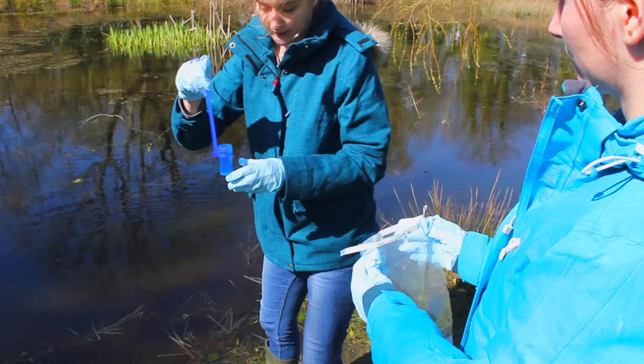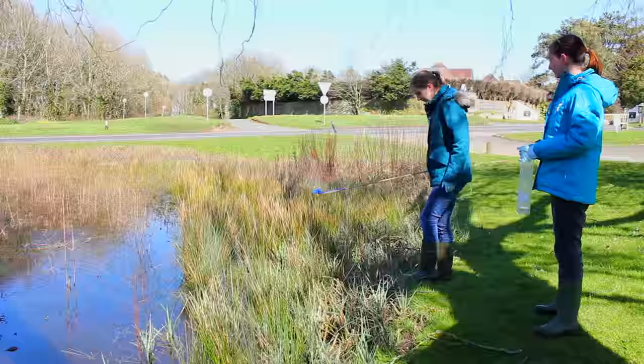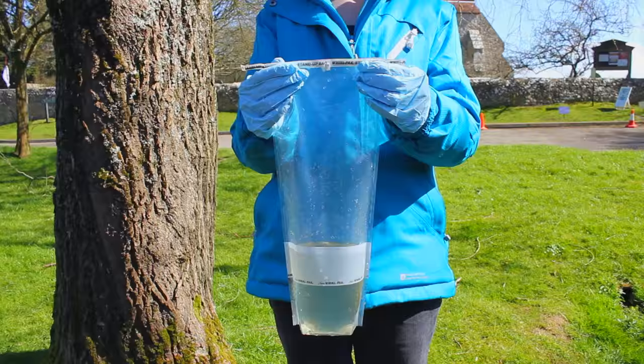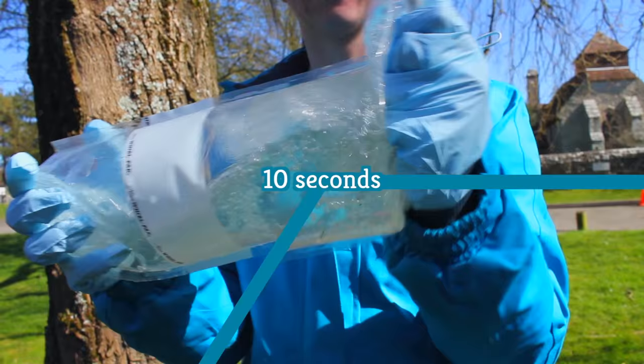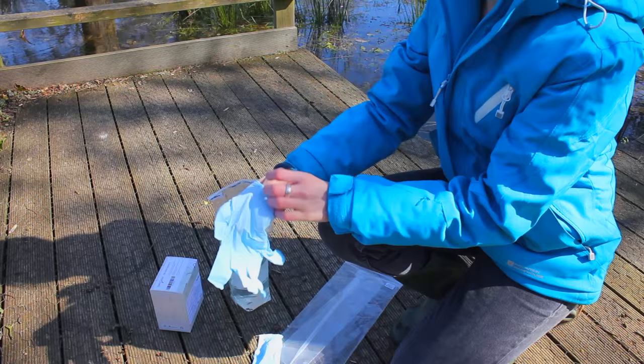We can see here Fran has collected a sample that is not full of sediment. Once you have taken the sample, pour it into the Whirlpack bag. Repeat this process at each of your 20 sampling locations and pour each sample into the Whirlpack bag. Once 20 samples have been taken, fold down the bag and fold in the top tabs. Then shake the Whirlpack bag for 10 seconds — this mixes any DNA across the whole water sample.